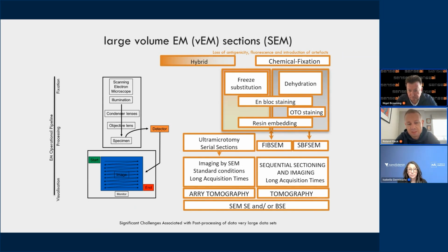And all of these techniques in the scanning electron microscope are quite prone to charge accumulation. So as you hit different parts of the sample, sometimes you get an accumulation of charge, which causes a distortion in the beam and just basically detracts away from the quality of your data sets. So again, something where we've worked closely over the past few years to try and exploit the line hop random scanning and sparse scanning approaches.